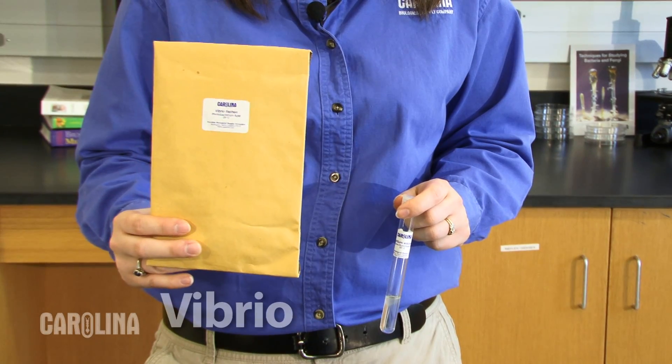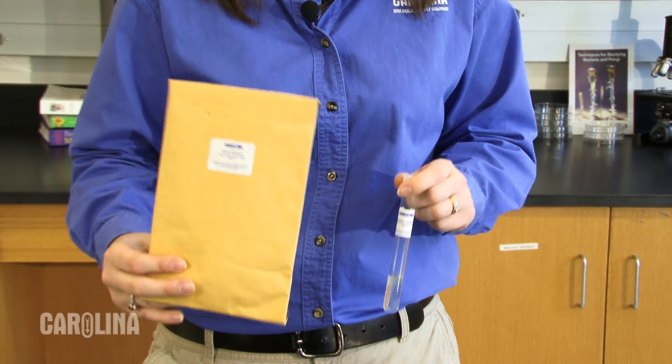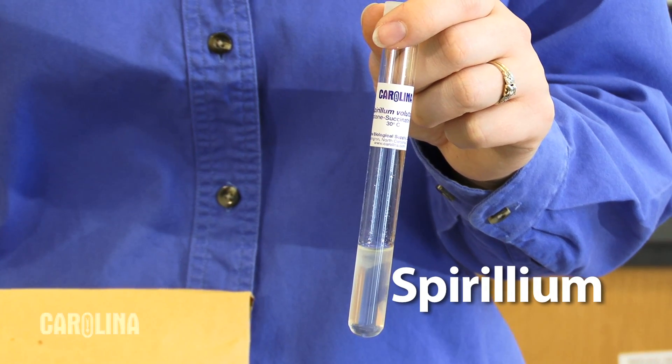The vibrio cultures are exceptions — keep vibrio cultures in their dark envelope and use them within one to two days of receipt. Place spirillum cultures in a 30 degrees Celsius incubator upon receipt. You can view all of our bacteria cultures, kits, and sets at carolina.com.